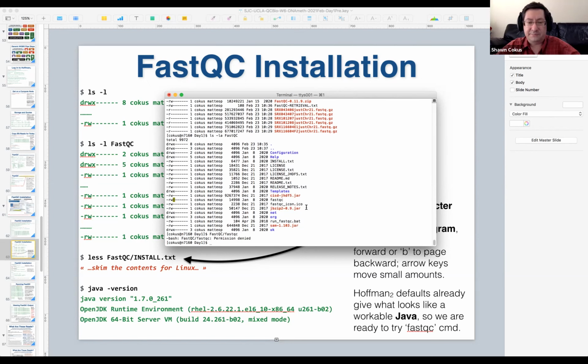And either the zip didn't communicate that information, or it wasn't executable when they zipped it, or for whatever reason, we didn't get the X bit on this thing. So we need to get it. Now, there's a lot of ways you can do this. Some people would do this or whatever. The way I like is the relative change.